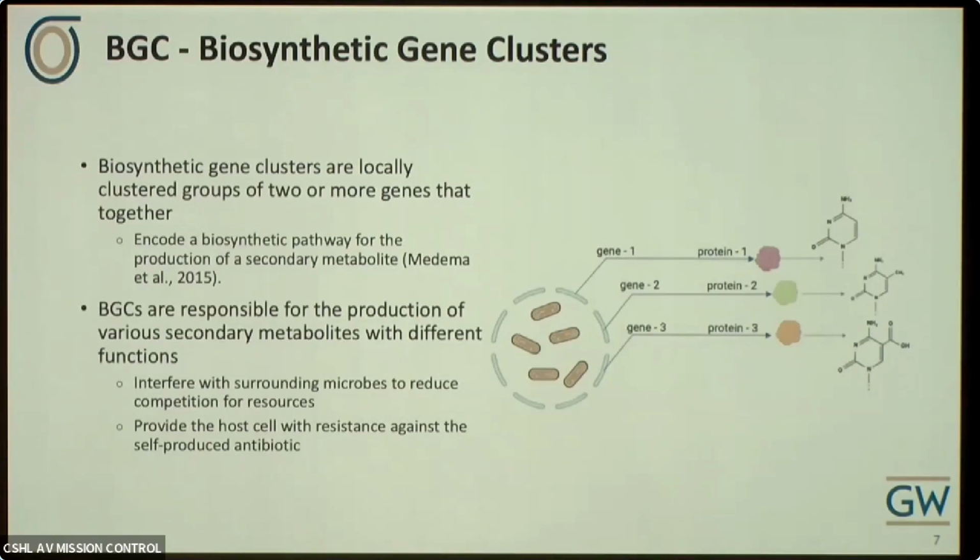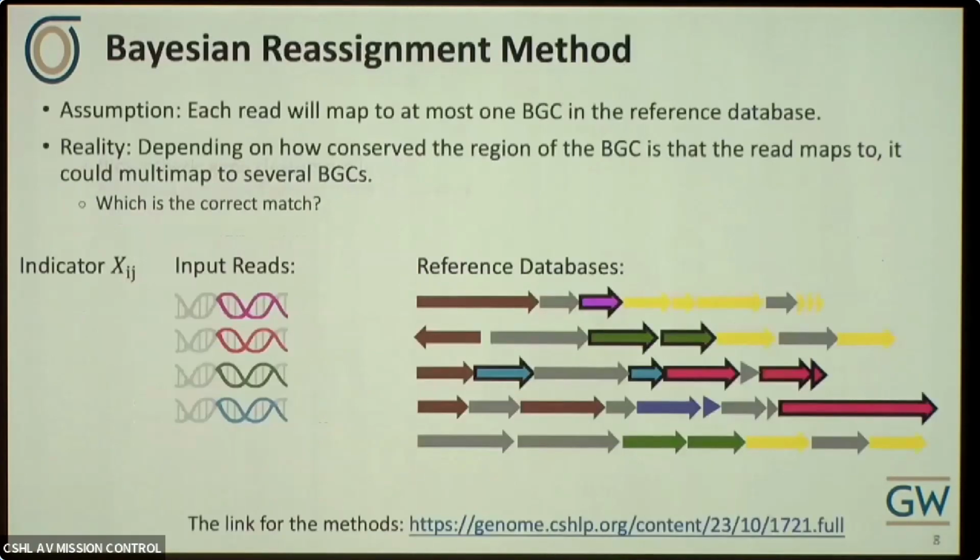As I mentioned before, the mapping strategy needs your reference database and your mapping strategy. So we go a little bit into the math part.